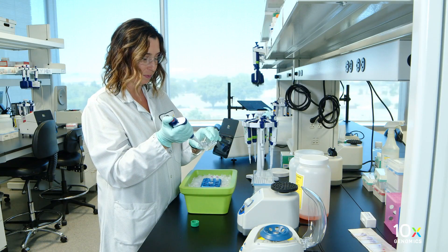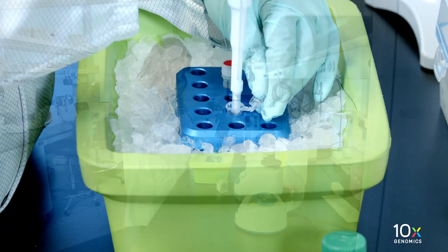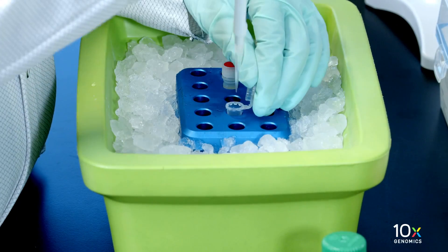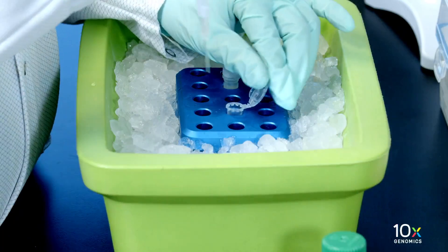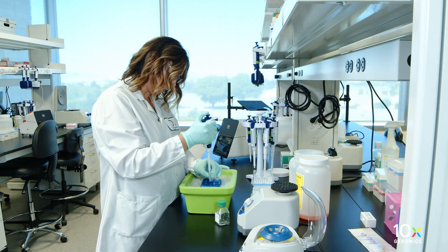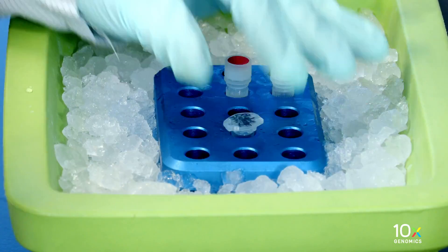Prepare the probe release mix by combining Nuclease-free water, RNase buffer B, and RNase enzyme. Probe release mix is viscous. Pipette mix thoroughly until the solution is homogenous. Maintain on ice.